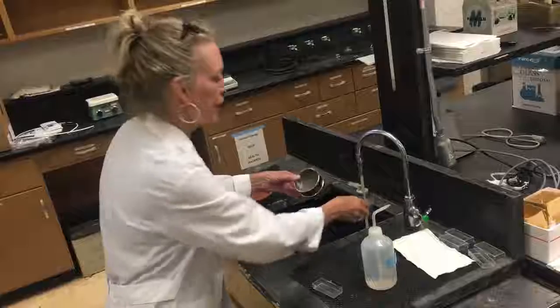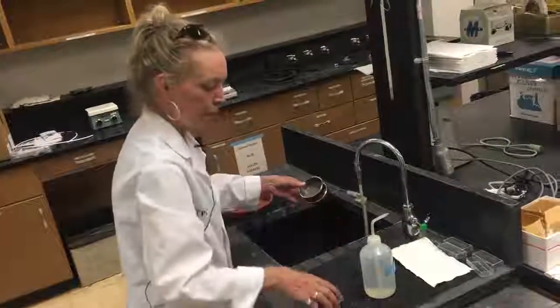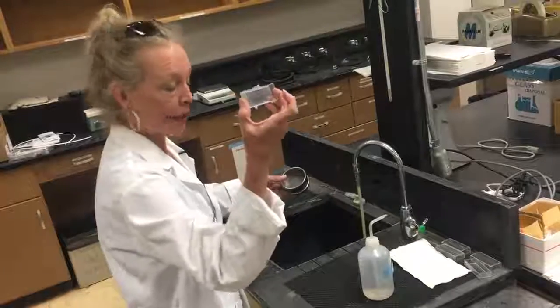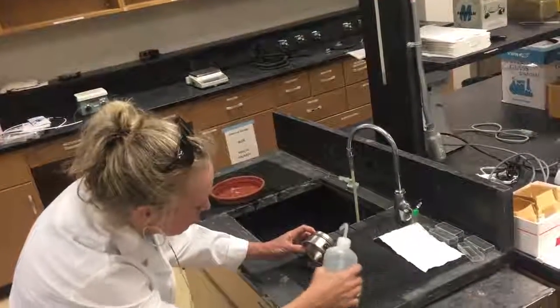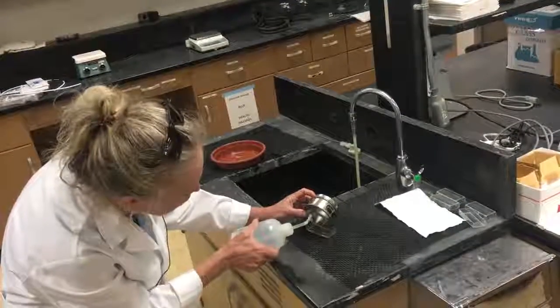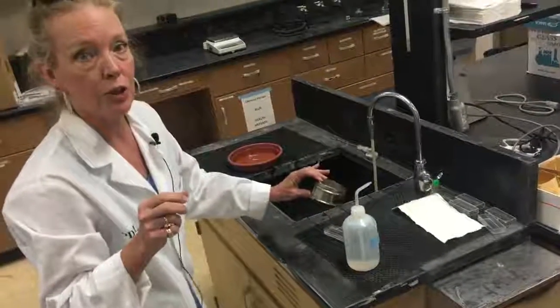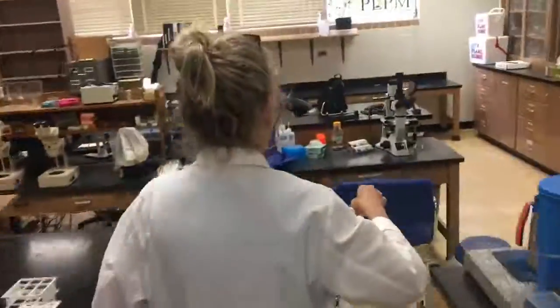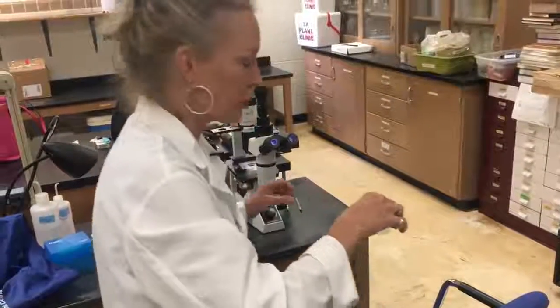Now we're ready to rinse that into what is called a counting chamber. It's got lines on it — it helps me guide when I'm looking under the microscope. I want to make sure I get all of them. Remember, nematodes can't be seen with our naked eyes, so we have to look at them under the microscope. This particular microscope is a specialized inverted microscope — the light comes from the bottom and the objectives are at the bottom.